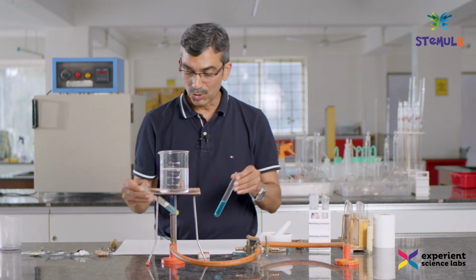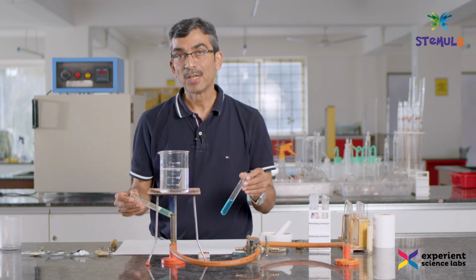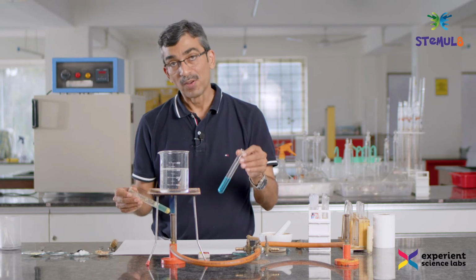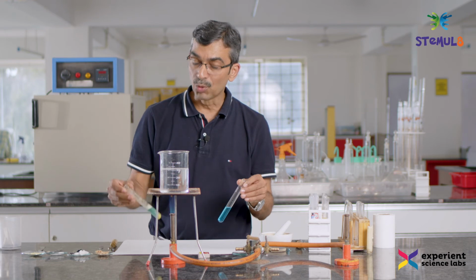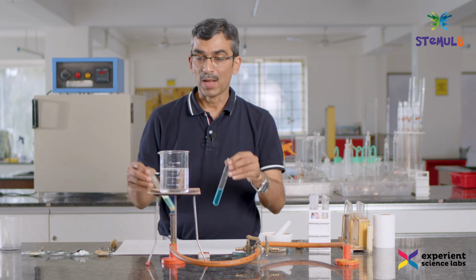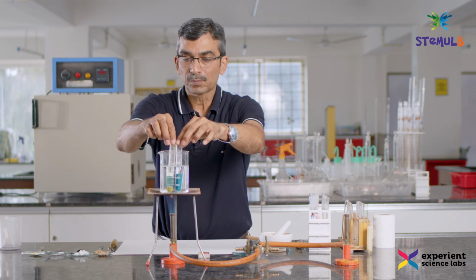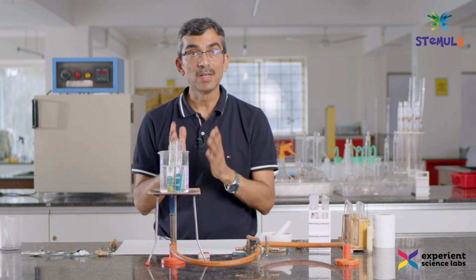As I said, we have these two solutions. We have added Benedict solution to it. One is a pure sugar solution, which will work as a reference point for us, and another one is a moong dal solution. I will add both of them to a water bath and let them be for a while, and we will see if there is a color change happening or not.